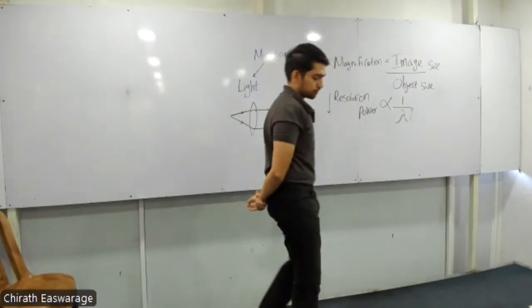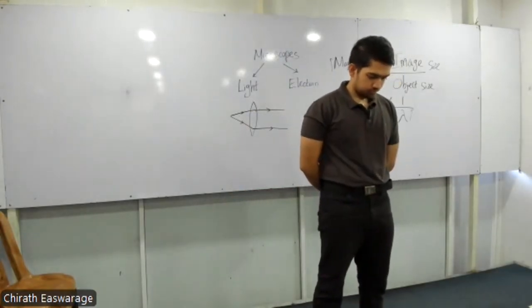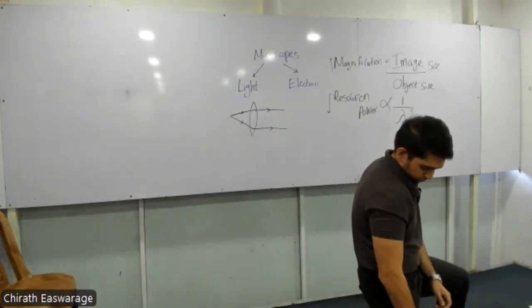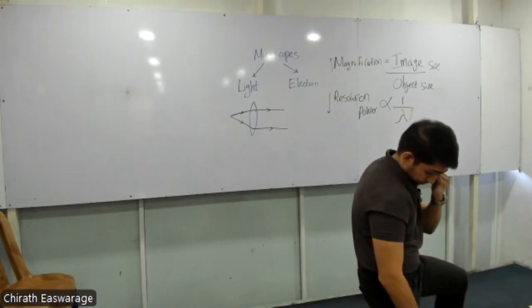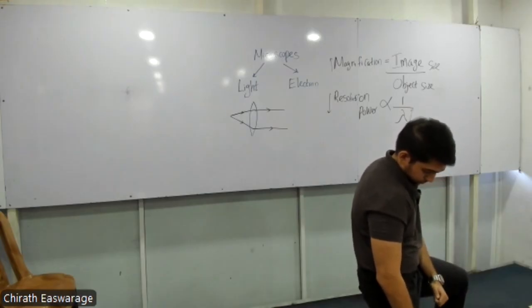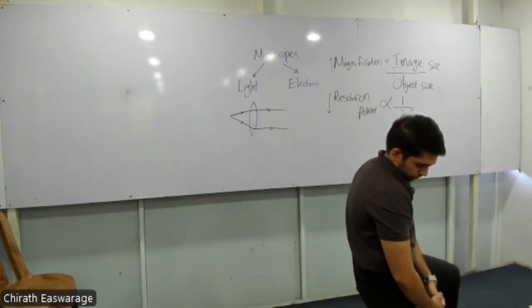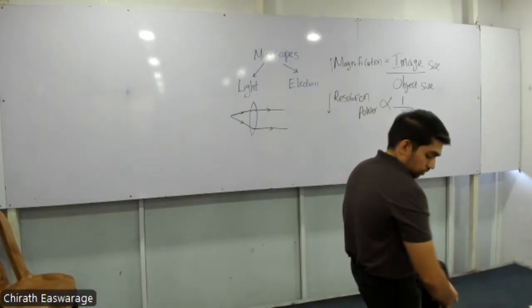Magnification and the resolution power. Okay.